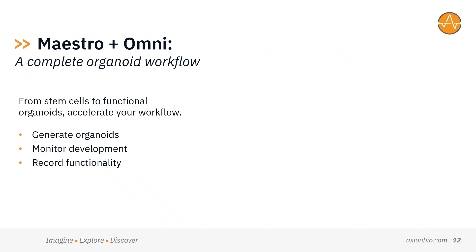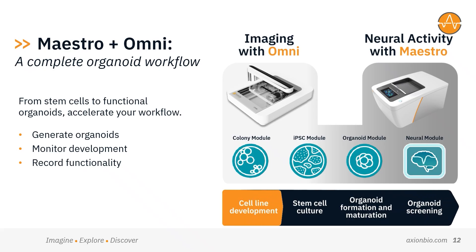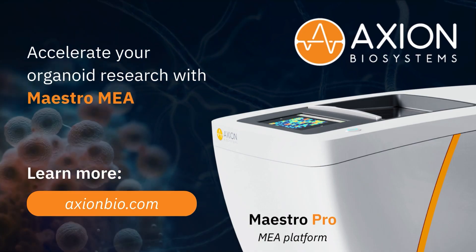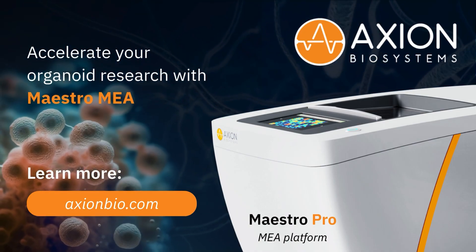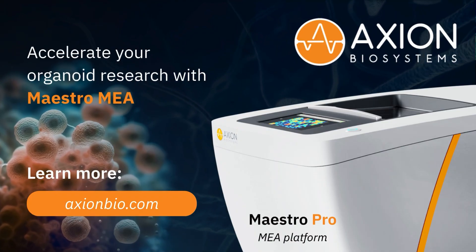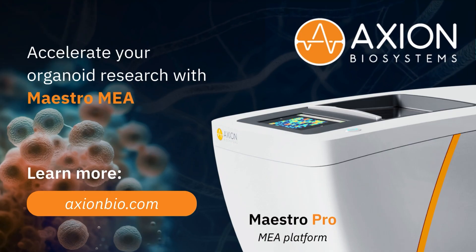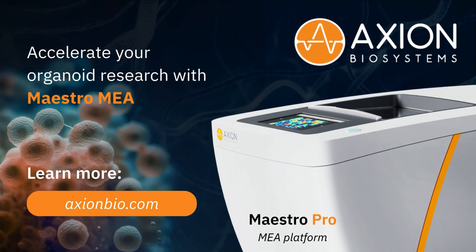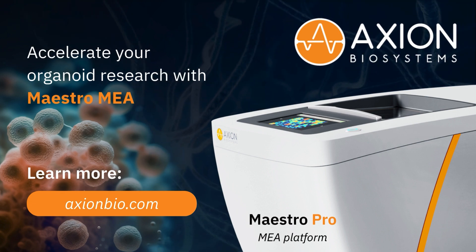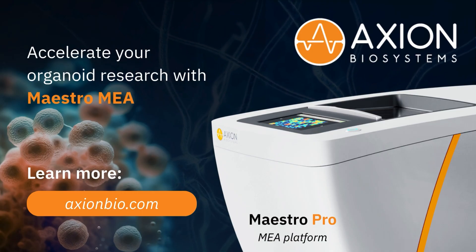When combined with Maestro MEA, the result is a complete, integrated solution. Generate organoids, monitor their development, and record their functional activity — all with Axion. At Axion BioSystems, we're driving the future of organoid research. Maestro MEA is more than a system; it's a platform evolving to meet the complex needs of today's science. Join the researchers already using Maestro MEA to illuminate how organoids grow, function, and respond, and see how our advanced organoid tools can accelerate your research. Visit axionbio.com to learn more.